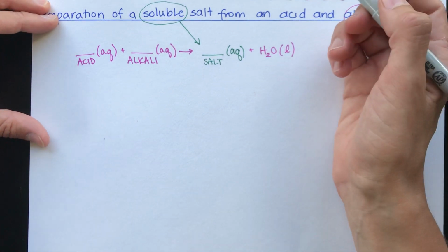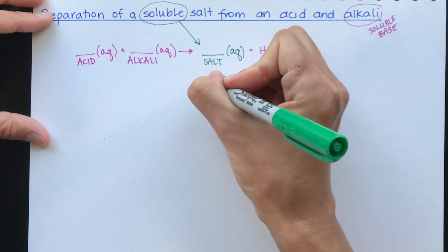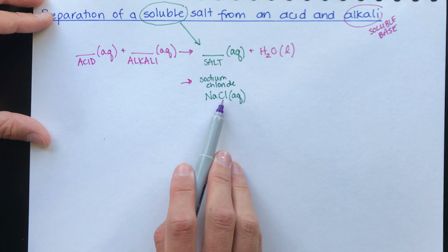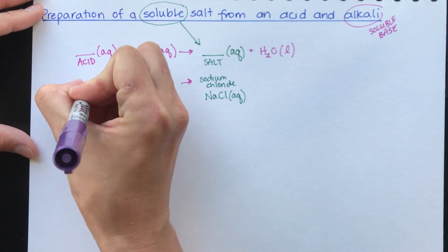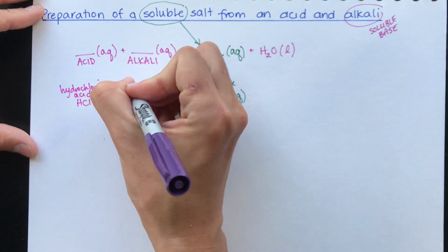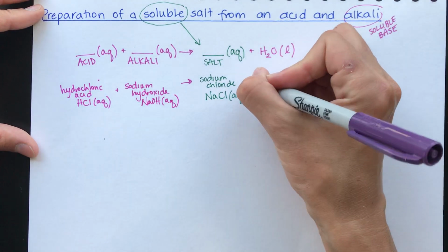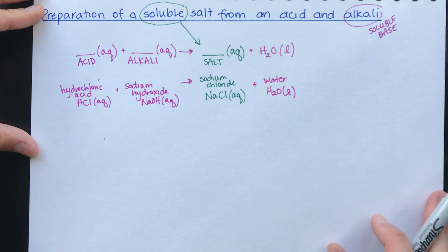The one we would have done if we had been in school would be the preparation of sodium chloride. Nice simple table salt. So let's go ahead and do that one. The acid you need, this time we're making a chloride in our salt, would be hydrochloric acid, HCl. And to get sodium, your alkali has to be sodium hydroxide. And these would both be solutions. Side product, water. All right, that's a nice easy one. That equation is already balanced for us.